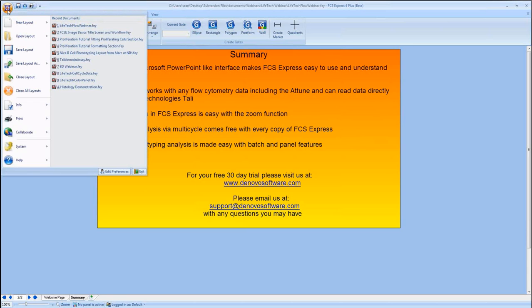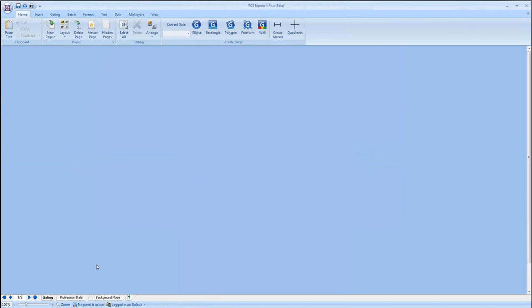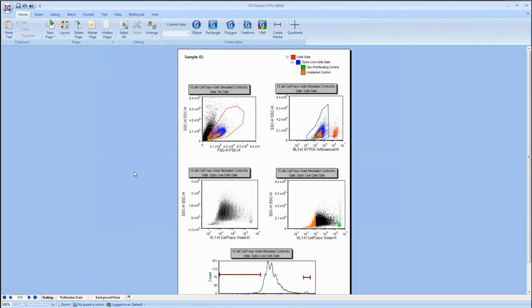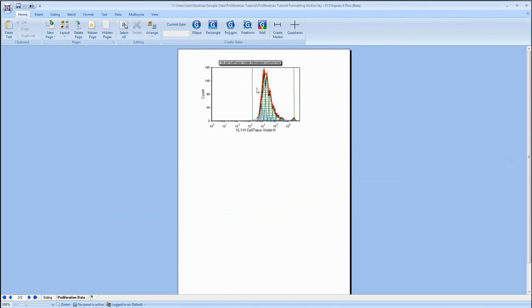Yeah, absolutely. It was one thing I didn't show today just for the sake of time. I did happen to have this up here, and it is with, of course, Attune data. You notice that this is proliferation data, and we have the proliferation modeling here as well. And we offered this tutorial to all of our customers with the Attune data, and the full proliferation modeling comes for free with FCS Express. And it's going to allow you to do a lot of very nice things with that data. Great.